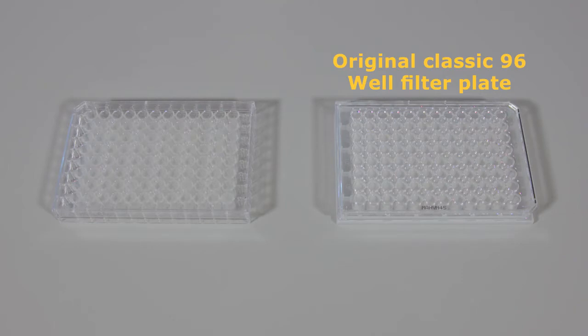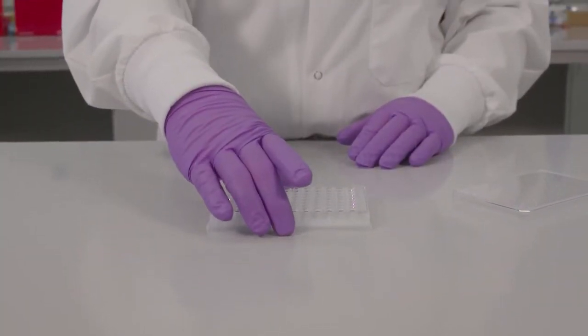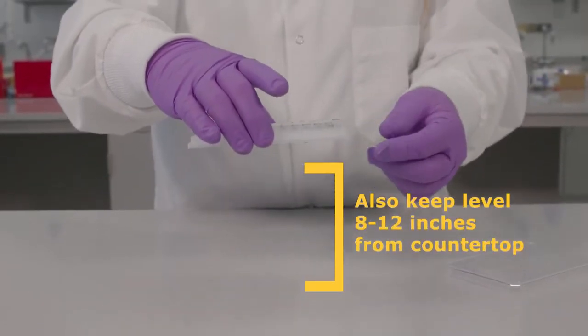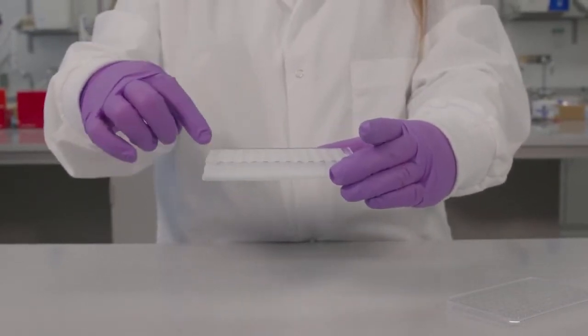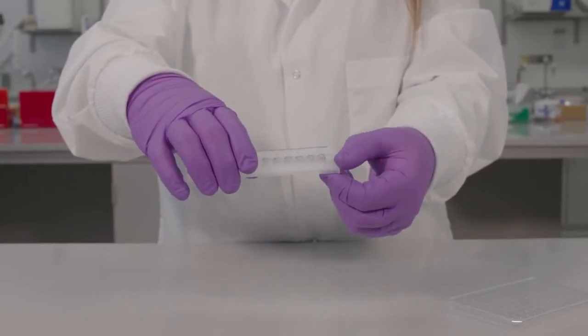The under drain skirt can be peeled away. With one hand, hold the filter plate — the top part of the plate. With the other hand, use two fingers to grasp the outer skirt in one of the four corners — for example, A1, H1, A12, or H12 — and pull down into the opposite corner.